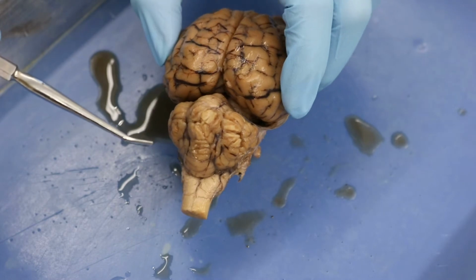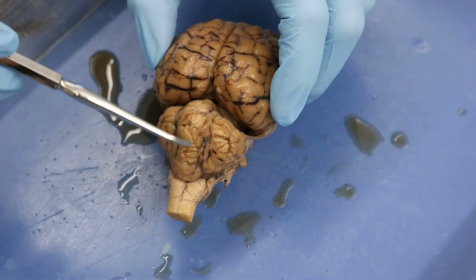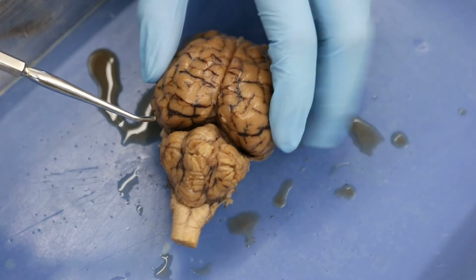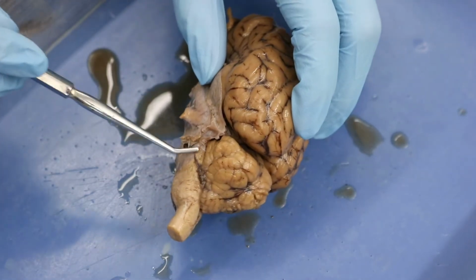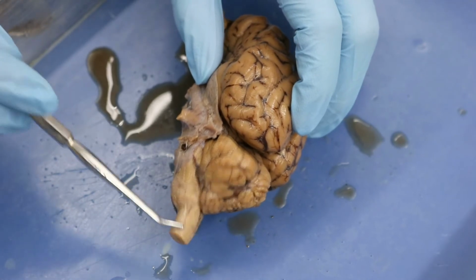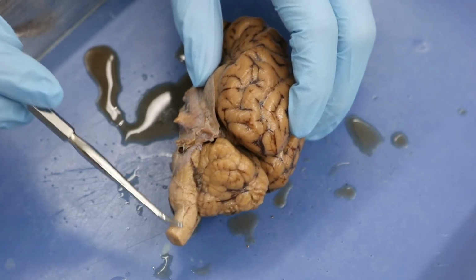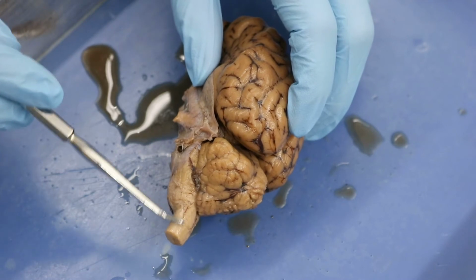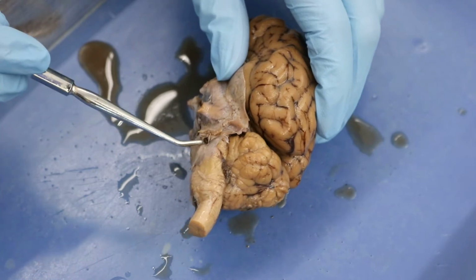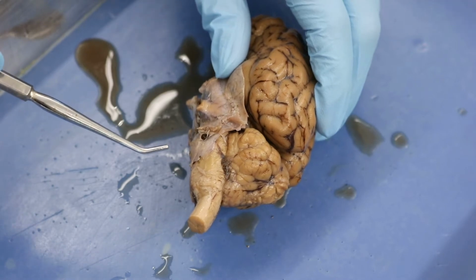The vermis is essentially the line in the center of the cerebellum. It looks a little bit different in sheep than it does in us. We also can see our brainstem. So our brainstem is this portion right here. The inferior, well, it's inferior on us, but posterior here. The posterior most portion on the sheep would be the medulla oblongata. And then we have this rounded pons here. And up under here is going to be the midbrain. And once we do some of our dissection, we'll get a better look at the midbrain, okay?